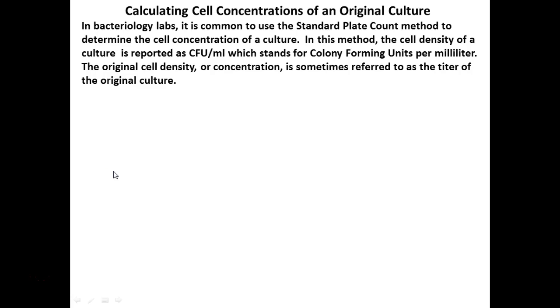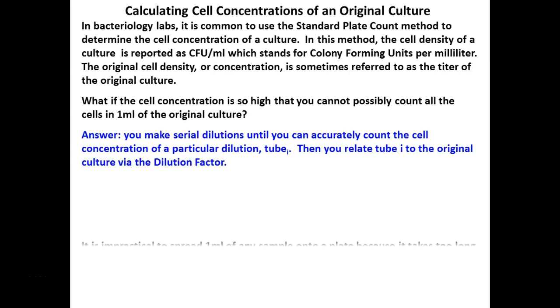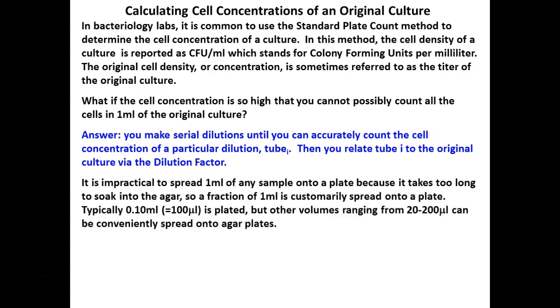So in lab, remember we use the term colony forming units. And again, typically we do it in milliliters. So notice too that I wrote down 0.1 milliliters instead of 100 microliters as to what I put on the plate. So that's the most common volume. Even though I did it in microliters, I can convert it all back to milliliters. You can go either way as long as you do your conversion correctly. So again, 0.1 milliliters equals 100 microliters.